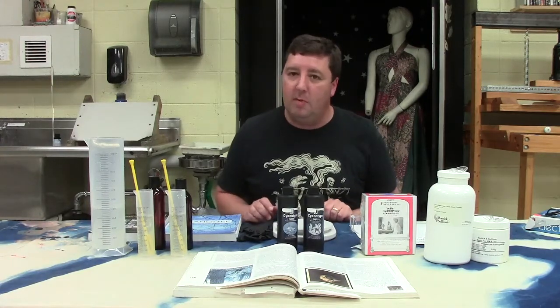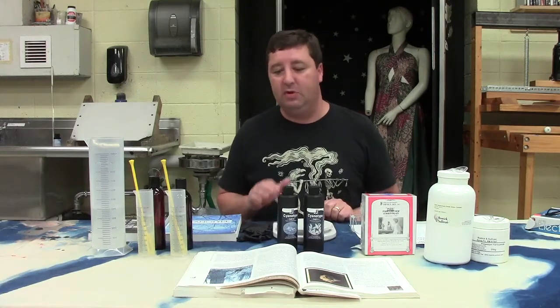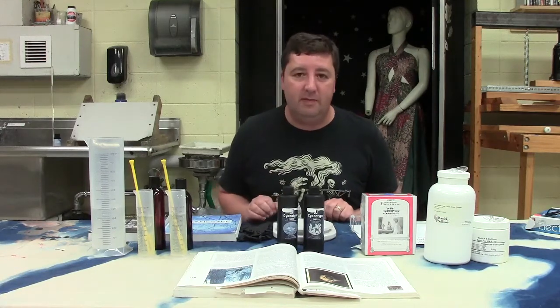Hey guys, this is Mr. Finkelston. Today I'm going to demonstrate how to mix cyanotype chemistry. In a second video I'm going to show you how to coat the paper and make an exposure with cyanotype, but let's just focus on the chemistry for right now.